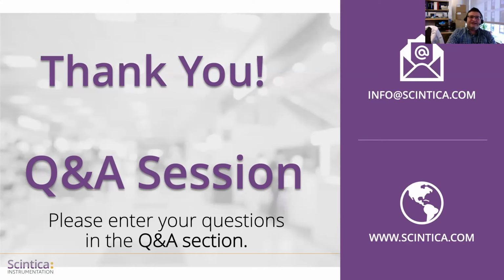Yes, I'm so glad you asked that, because we did see a little bit of an effect on lean mass, and I didn't go into this just for the sake of the time of the presentation, but they do have a little bit of a decrease in lean mass as well. Definitely not as strong as the fat mass, and you can see muscle weight was slightly decreased too. So there was a little bit of an effect there, but I focused on the fat mass because that's where we had the strongest effect. And because we're really interested in, like I said, those mesenchymal progenitors, they turn into fat and they turn into bone. So we were not necessarily muscle experts at the time, but we did report those parameters in our papers.